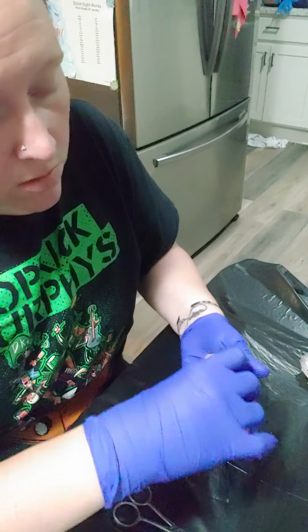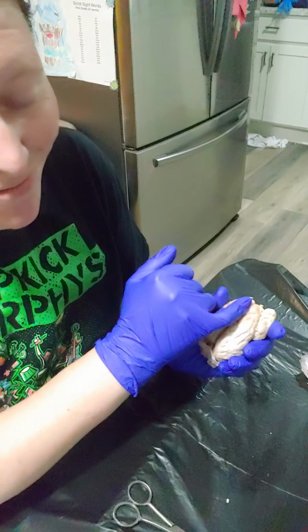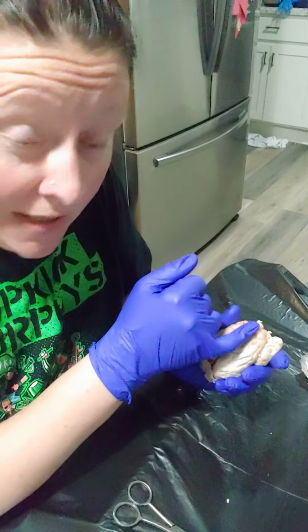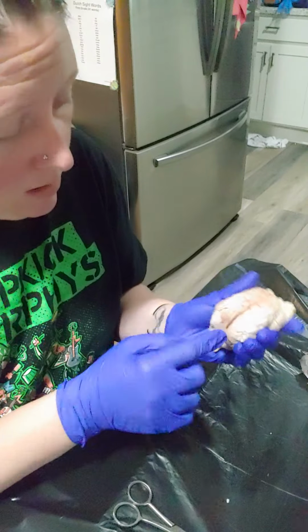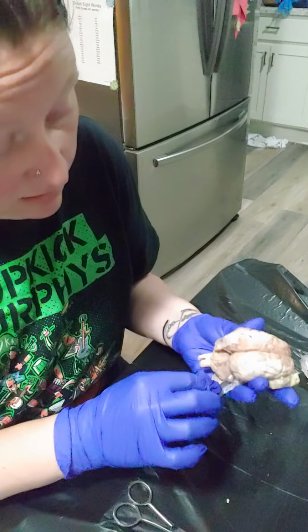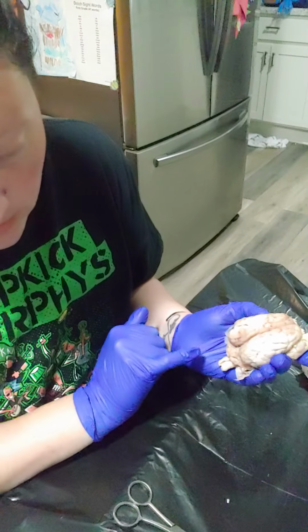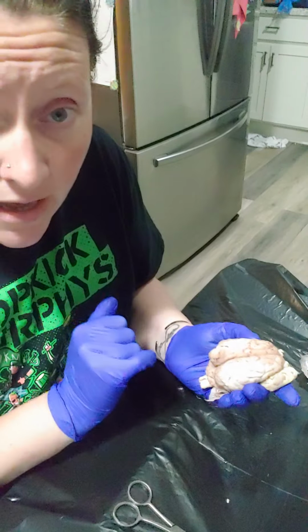So your longitudinal fissure, the really long fissure that divides the hemispheres, is going to be right here, right down the middle, all the way back. Again, I didn't get all the casing off, but I was scared I was going to break something I needed. So it goes all the way back to the cerebellum, and it divides your halves into left and right.